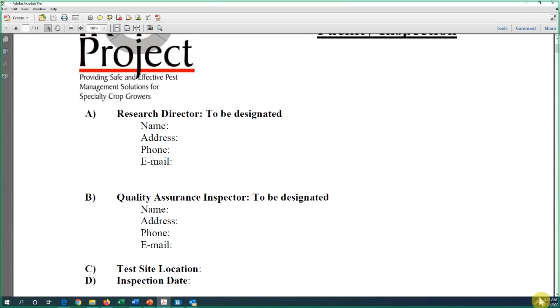If you are the study director, talk to the registrant, talk to the agencies. Make sure this is in their acceptable range. Otherwise, when it's done, they will ask you a lot of questions about why you did that. Even if they approve it, they will ask you to show how you did method validation and why you matched the matrix. Because you will tell them, if I don't use that, the recovery is consistently 60%, 55%.